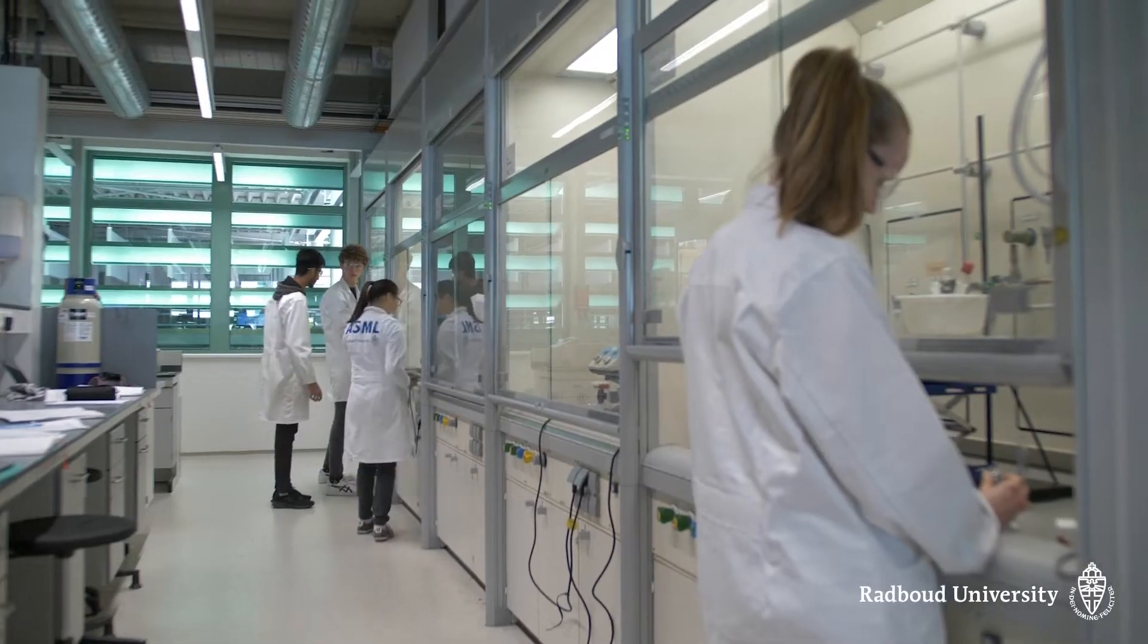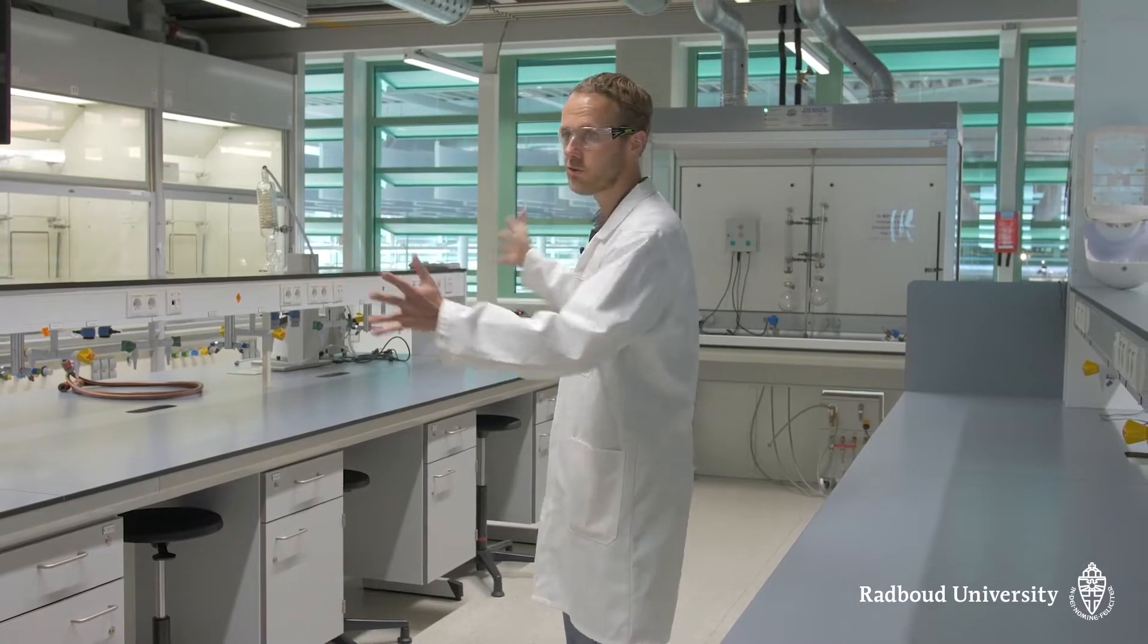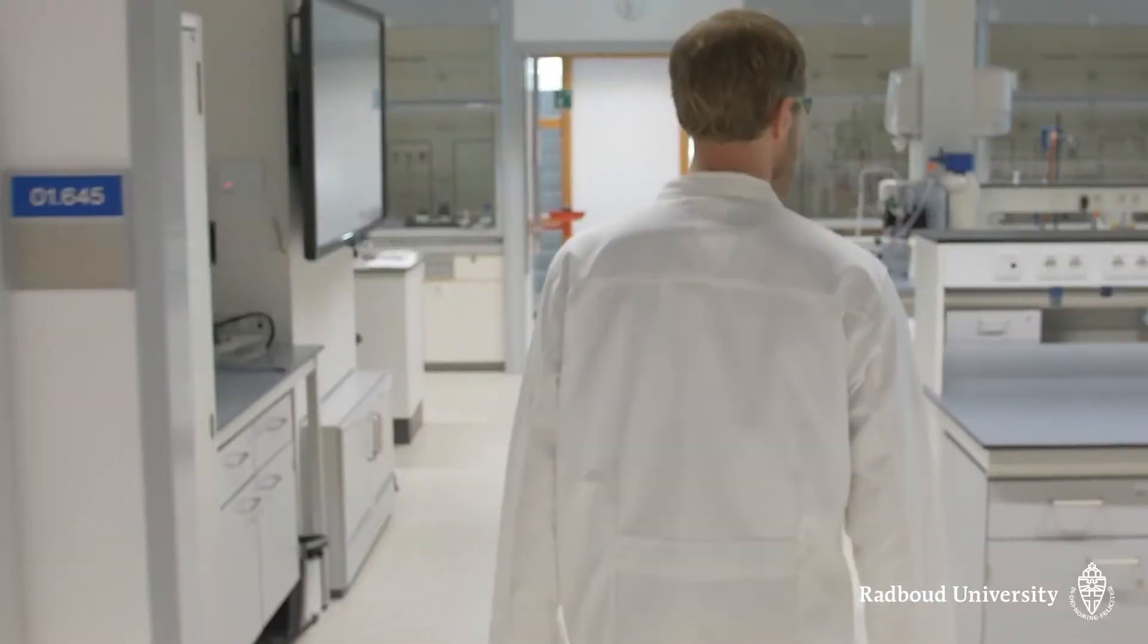As you can see, the rooms are quite spacious and they contain lab tables and fume hoods. Compared to other labs in the world, I would say our labs are also quite well equipped.